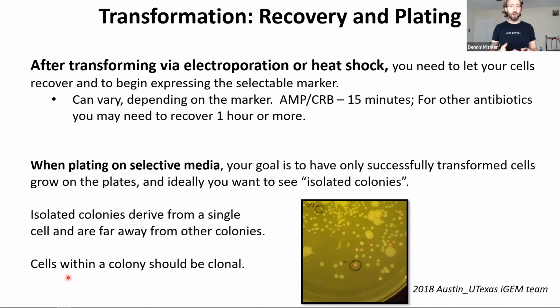This is really important because if you have an antibiotic that stops all translation, and your cells have not already translated the gene that gives them resistance to that antibiotic, well, they're never going to, right? The antibiotic is present, it's going to halt all translation. So it's really important that you let your cells recover for a little bit before you plate them.